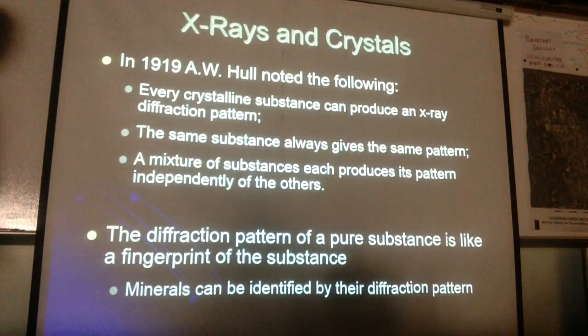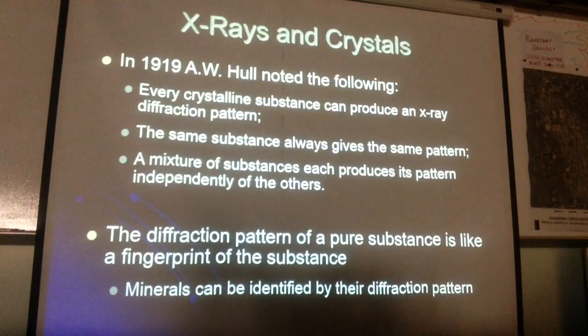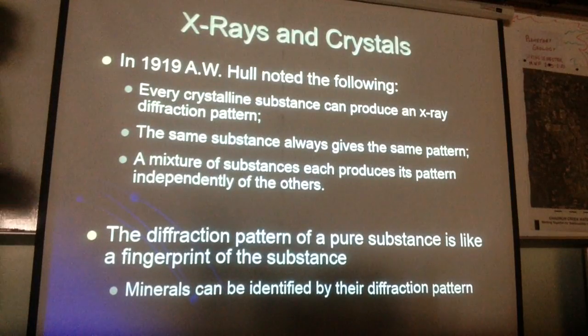But the diffraction pattern of a pure substance is basically like the fingerprint of the substance, and from that you can determine exactly what the composition is. So minerals can be identified by the diffraction patterns.